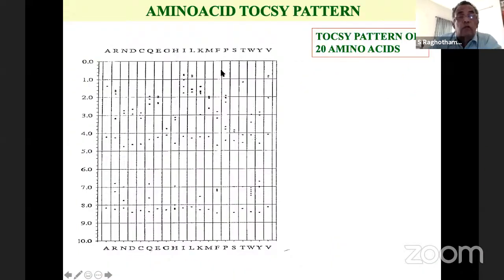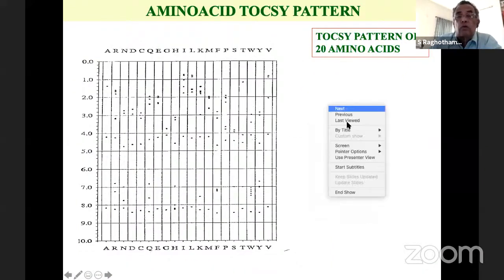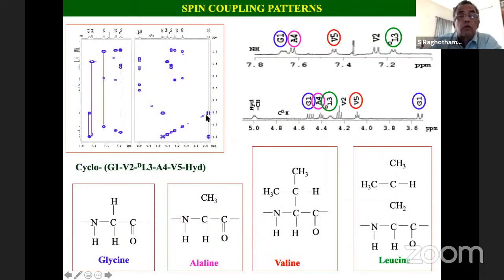And now there is one more there. This is called hydroxy acid, so let us not go into those things. I have not mentioned it here. Because there is no NH, you cannot pull it out from here. You have to go to this region to pull it out.